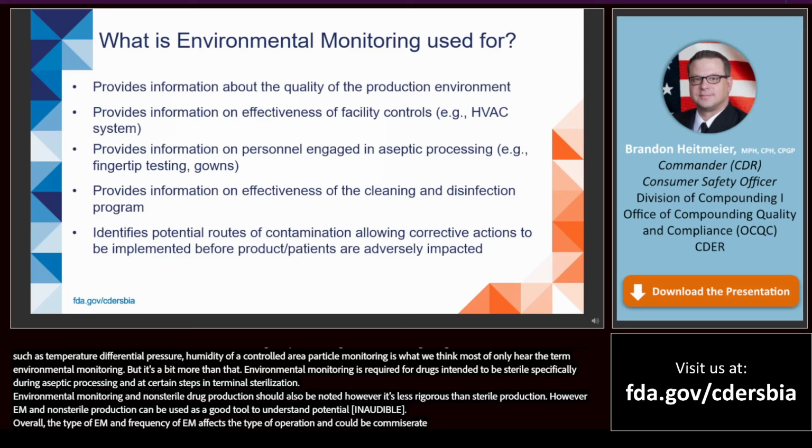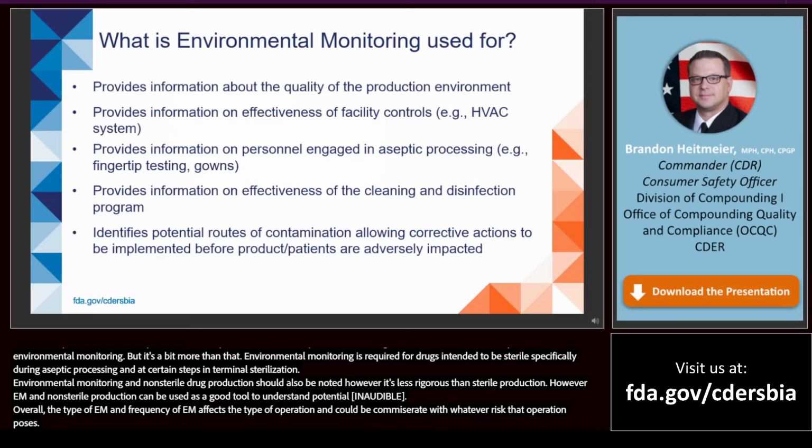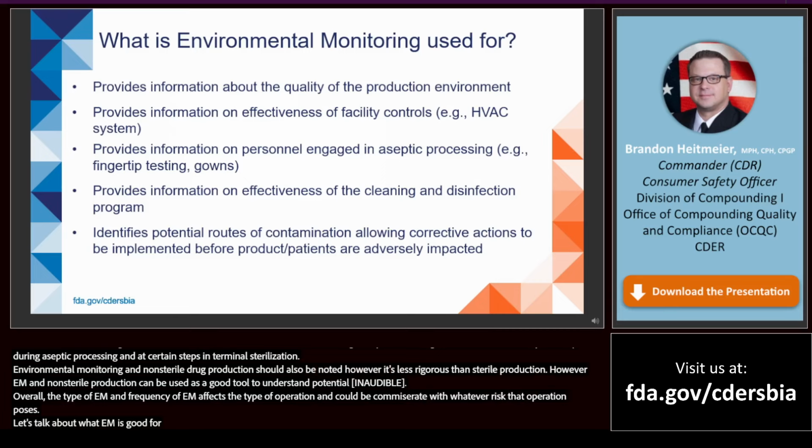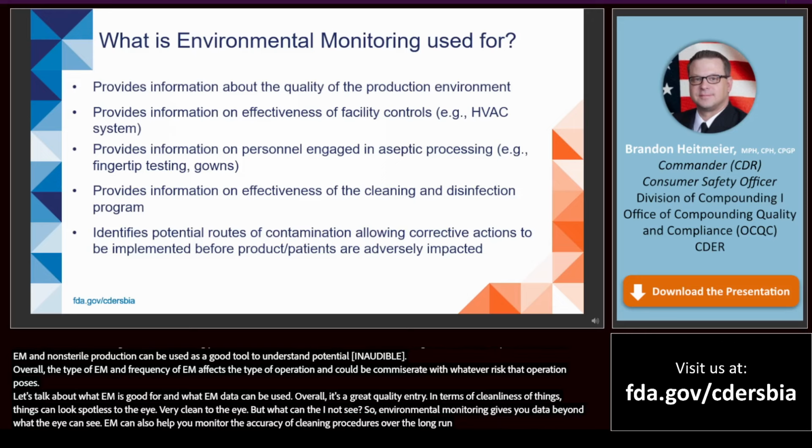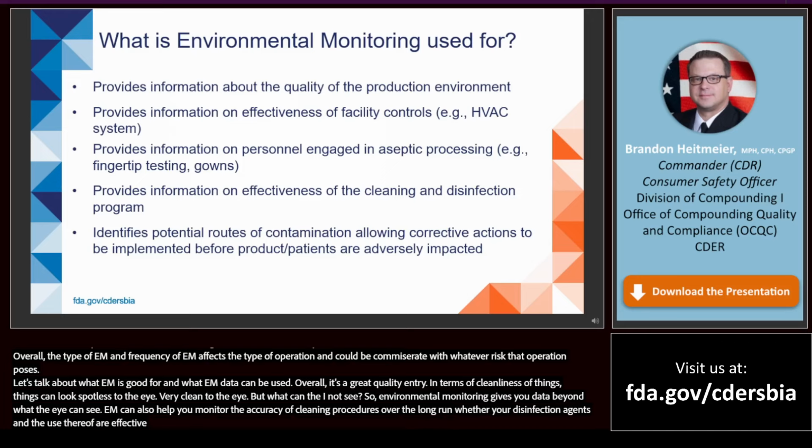Let's talk about what EM is good for and what EM data can be used for. Overall, it's a great quality metric. So in terms of cleanliness of things, things can look spotless to the eye, very clean to the eye, but what can the eye not see? So environmental monitoring gives you data on the environment beyond what the eye can see, certainly. EM can also help you monitor the adequacy of cleaning procedures over the long run, whether your disinfection agents and the use thereof are effective against the flora in your facility, but it's also much more than that.